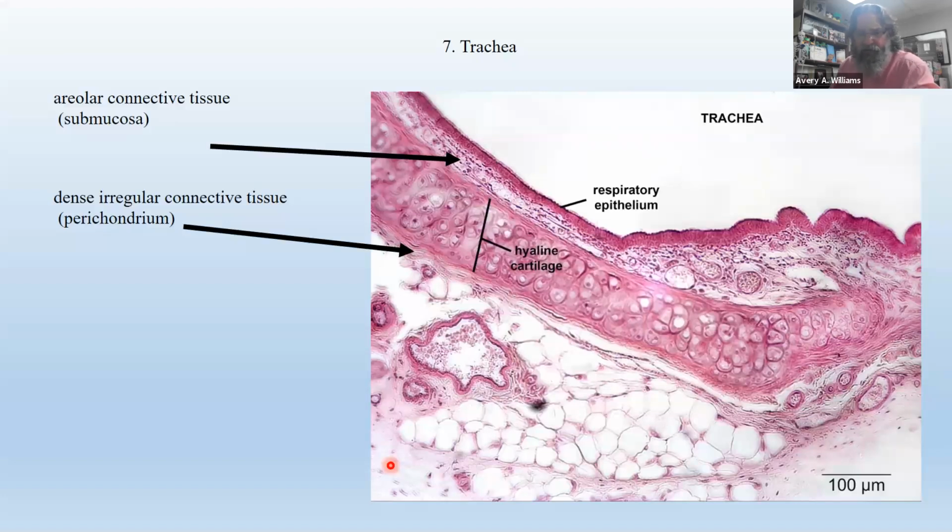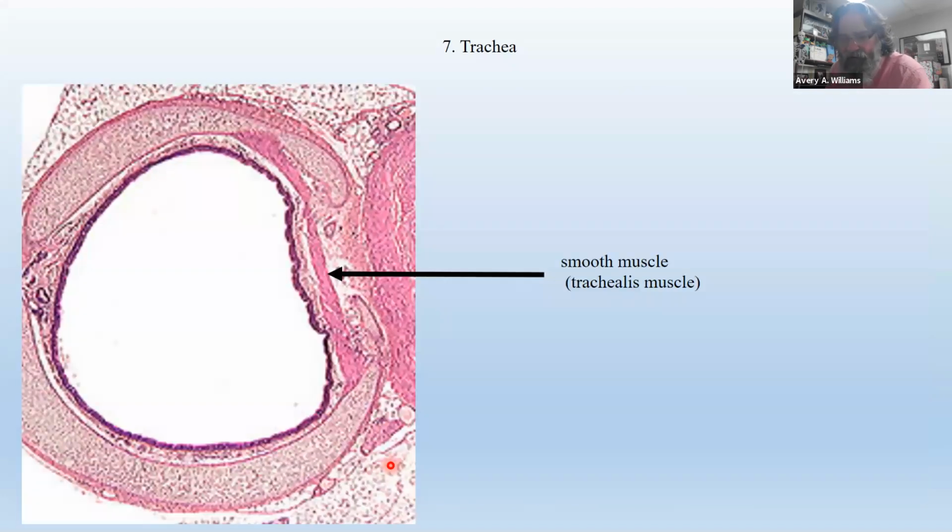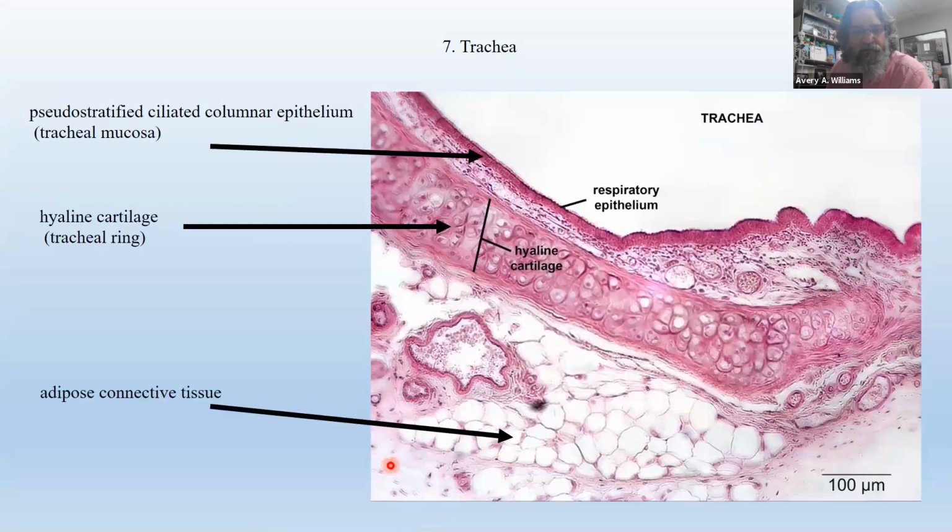What am I doing here? Why did I do that? I think that was probably just a boo-boo on my part. It's pointing at the same stuff, isn't it?